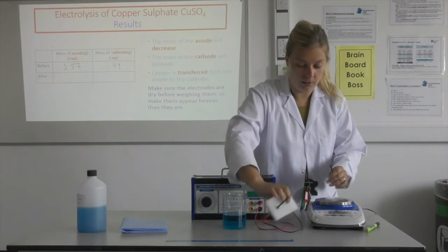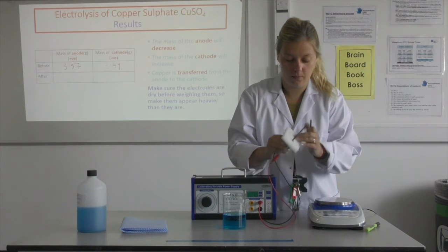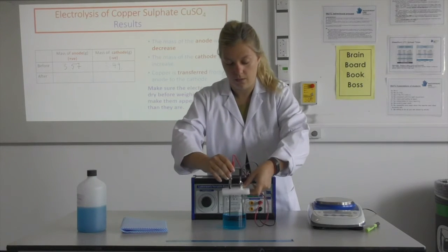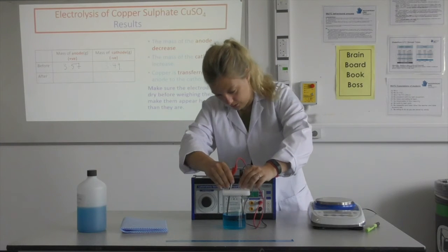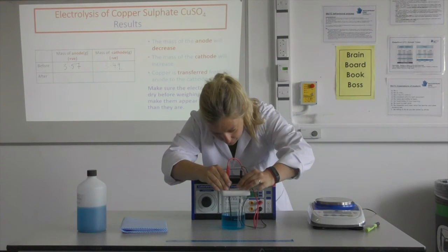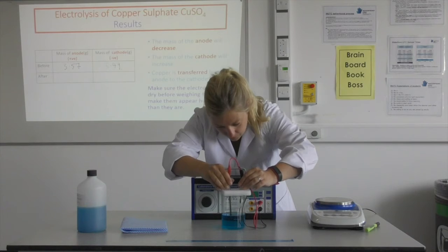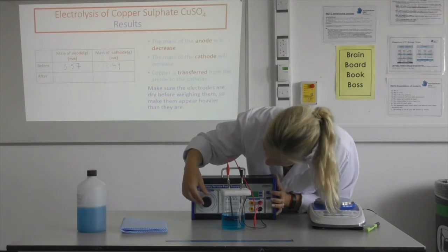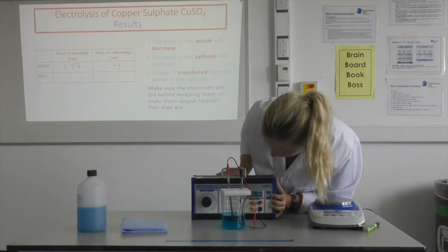Okay, so I'm going to connect this up now. Make sure it's in the solution. And I'll turn on my power supply. I'm going to put this on to 0.5 volts.